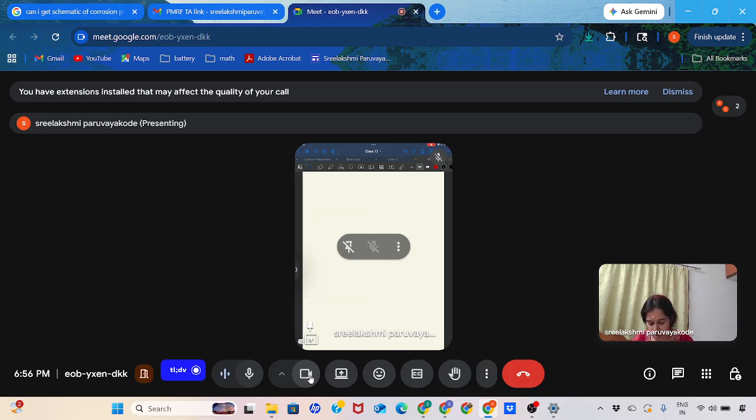Now, finally, your cases. Anion vacancy consumption: anion vacancies are generated at the metal film interface, diffusing through the film and reaching the film solution interface.